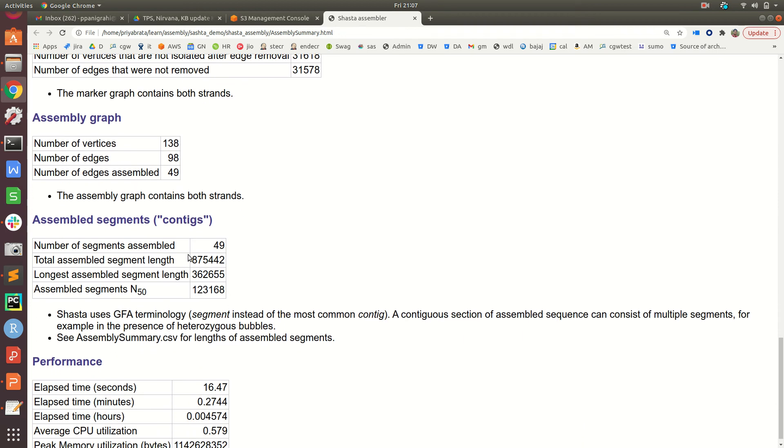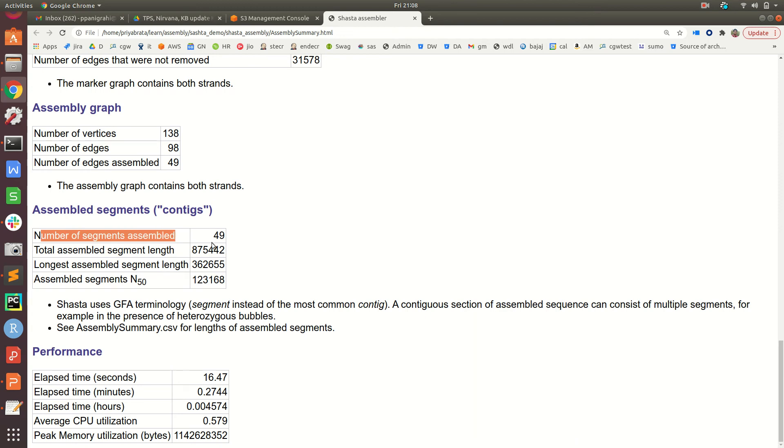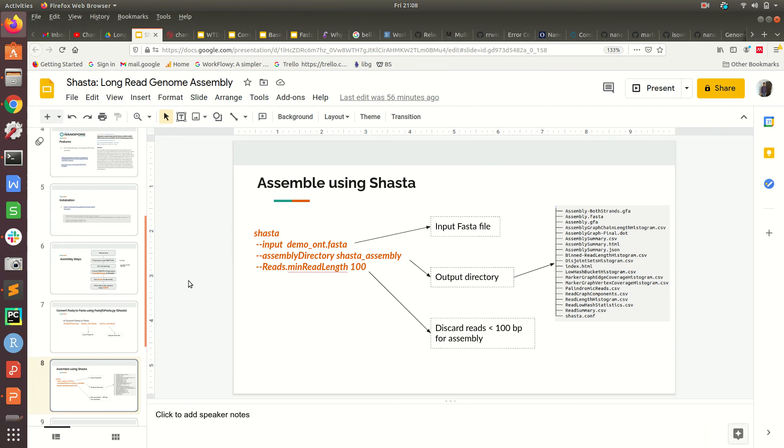Scrolling down to the contig information: Shasta calls assembled sequences 'segments', which are equivalent to contigs. The total number of segments assembled was 49, with a total assembled length of around 800,000 bases. The length of the longest contig and the contig N50 value are also reported here. While Shasta provides this summary, we will also use QUAST as a third-party tool for assembly statistics.